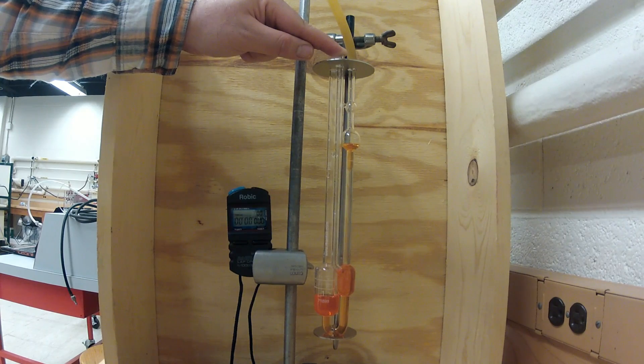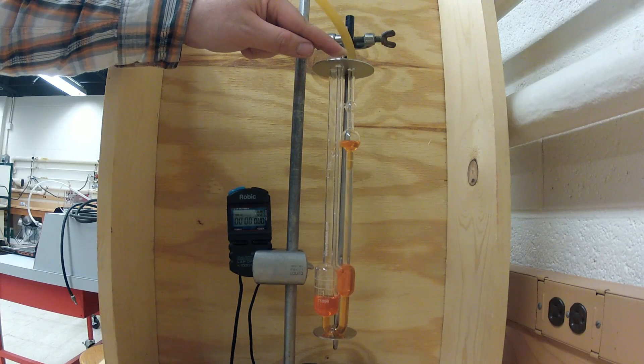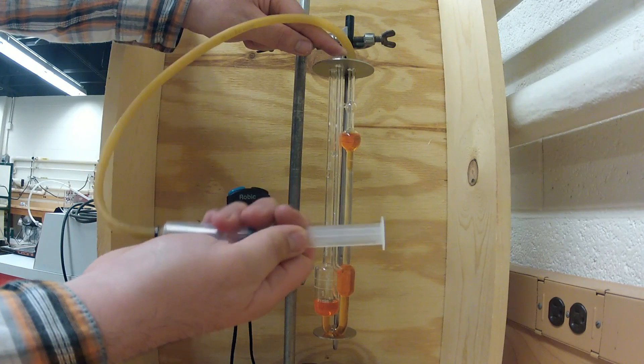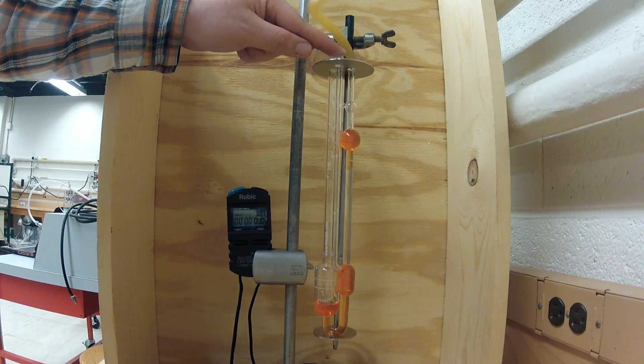You can see the fluid being drawn up the viscometer. Before a vacuum can be drawn, you must place your finger over viscometer tube 3, also shown in figure 1.